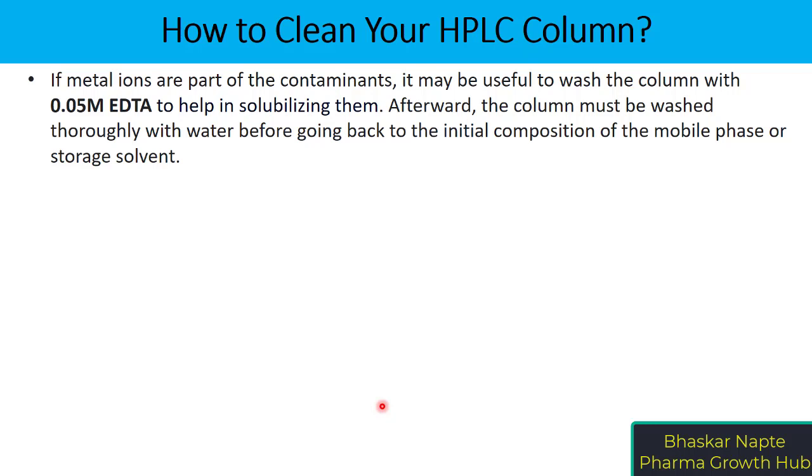A third effective cleaning agent is EDTA, especially if you suspect the column has been contaminated with metal ions. EDTA can form a complex with the metal ions, which can then be removed from the column. Afterwards, you must wash the column thoroughly with water so that the EDTA is also washed out, and then decide whether to continue with organic solvent washing or proceed to column storage.